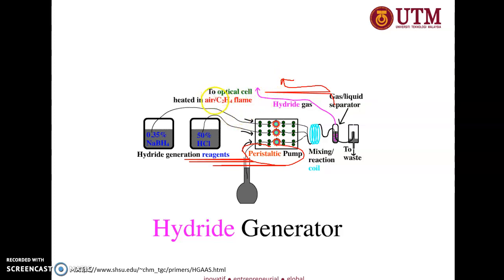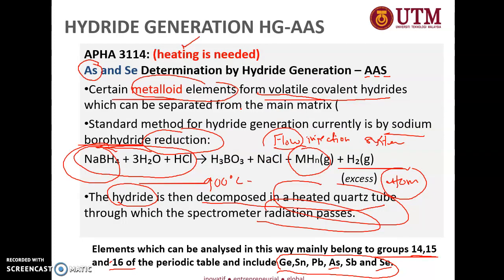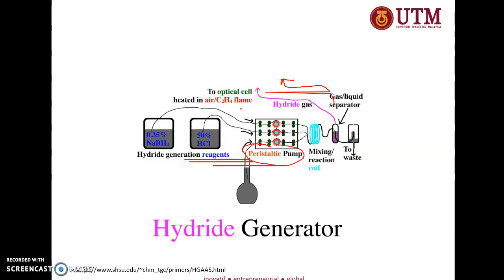What is used in heating the quartz tube? You can use the same fuel oxidant flame here, or we can use an electrified quartz tube heating element. This is applicable to more state-of-the-art instruments. The flame is the one that is 10 or 15 years back.